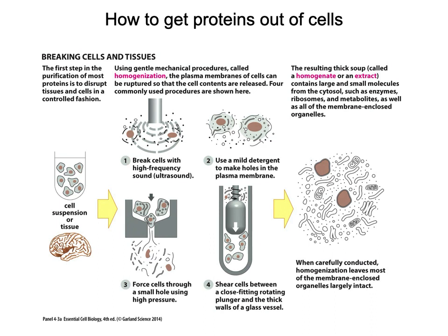And so we're going to need to make sure that we break these cells apart if we're talking about a tissue, or, if we've got a nice lawn of cells on the tissue culture dish, we need to make sure that they're separated into a suspension. And then we want to make sure that we break the cells apart so all the material inside the cell is released into this solution. Okay, so what we're going to end up creating is a homogenate, or an extract.